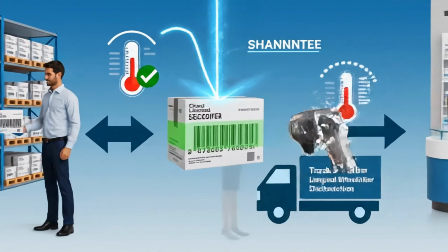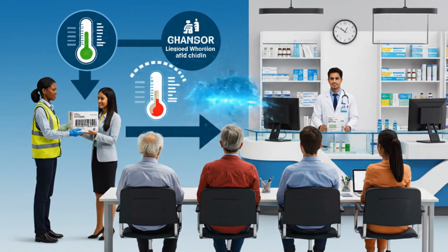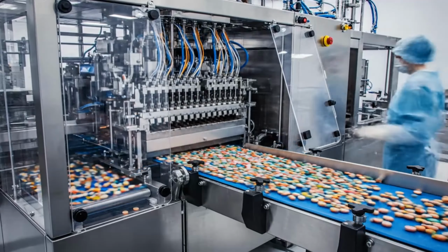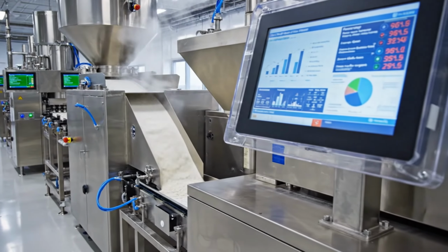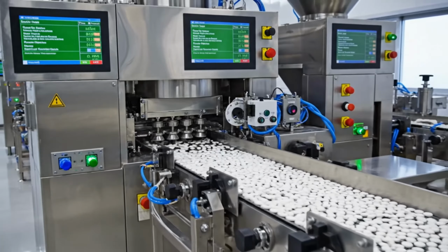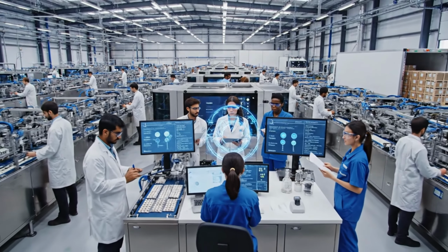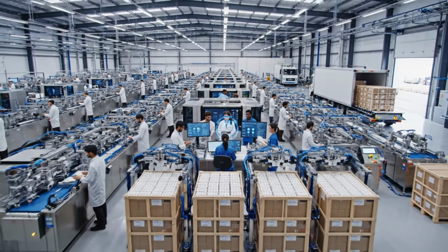Good distribution practice regulations govern the entire movement of pharmaceutical products after they leave the manufacturing site. The global pharmaceutical manufacturing industry produces hundreds of billions of solid oral dosage forms every year. Continuous manufacturing represents a fundamental shift in pharmaceutical production philosophy. Instead of making, testing, and releasing a batch over days or weeks, the process runs continuously. The manufacturing of a single tablet or capsule involves hundreds of individual process steps.